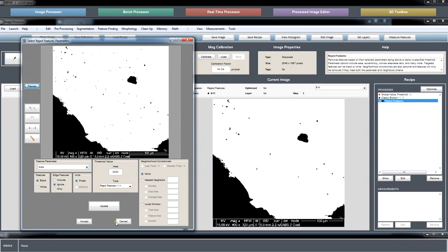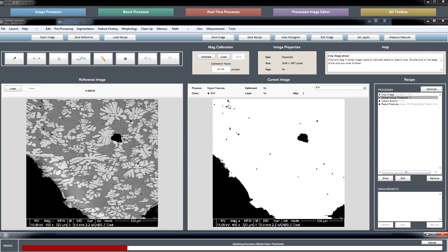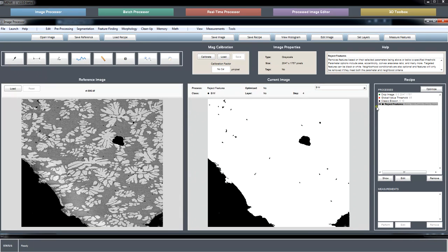Oh, and that actually doesn't touch the edge. Okay, well, there's no sense in making our life extra difficult over the micron bar. So I'll just show cropping out the micron bar, but not cropping the rest of your image, and still working with a non-rectangular area of interest.